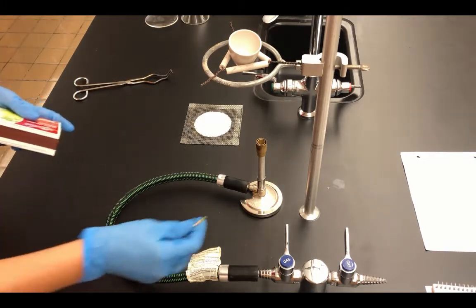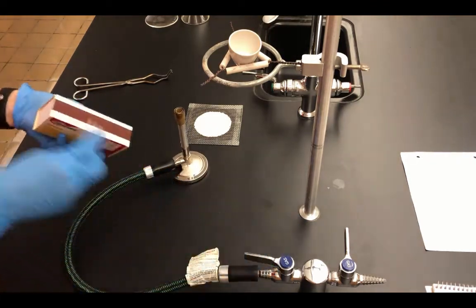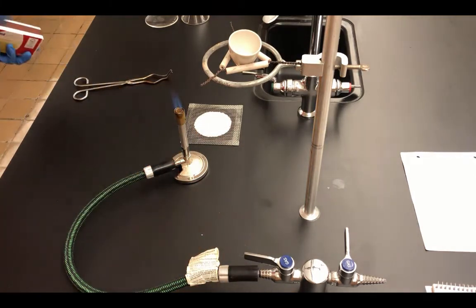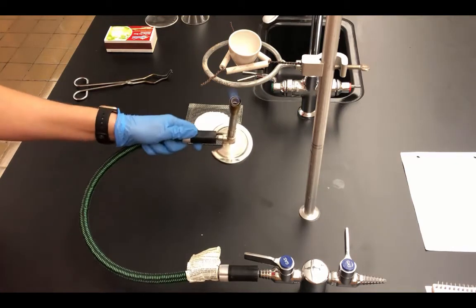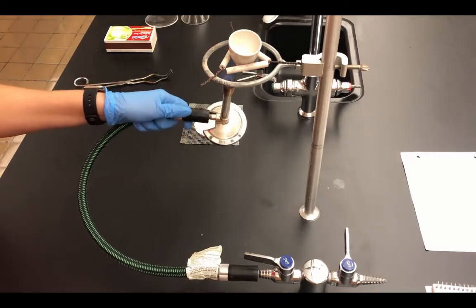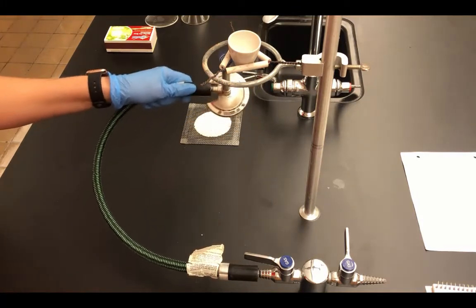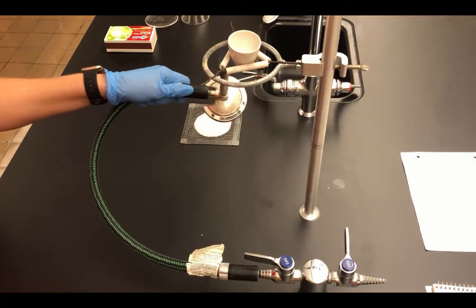Now what we're going to do again is light the Bunsen burner. So I'm going to turn the gas on, light the match, and come up from the bottom. Okay, and then again, we're going to heat this again. We're going to repeat the steps until the mass stays constant.